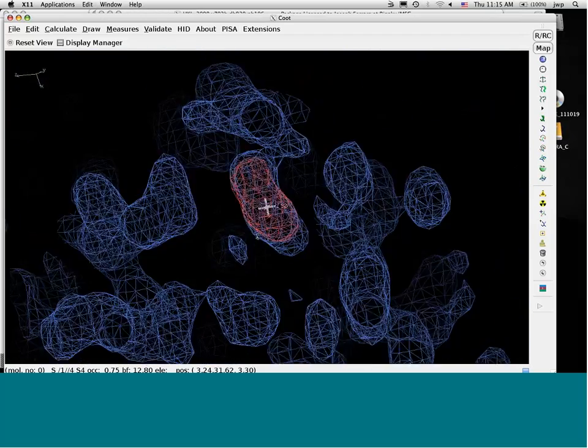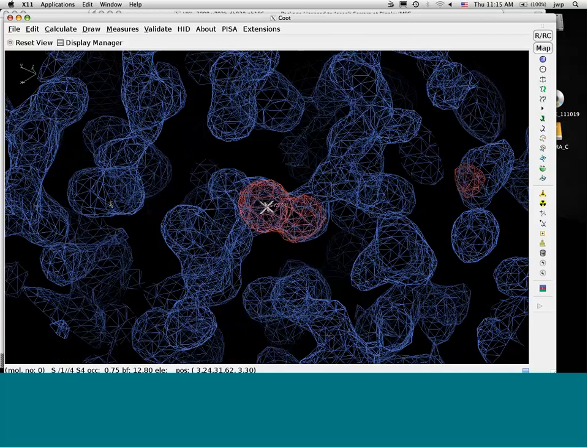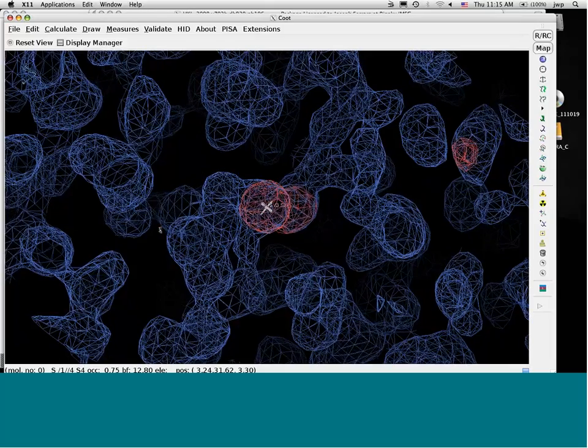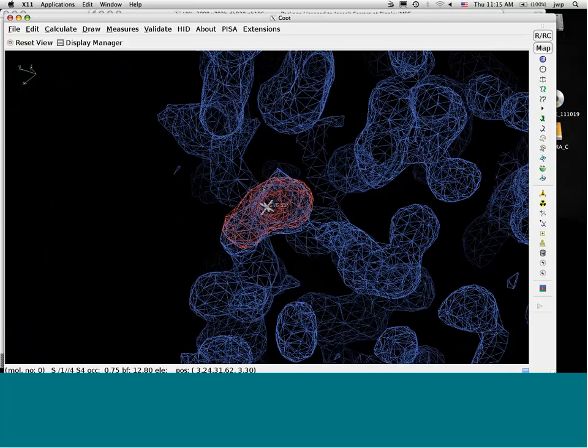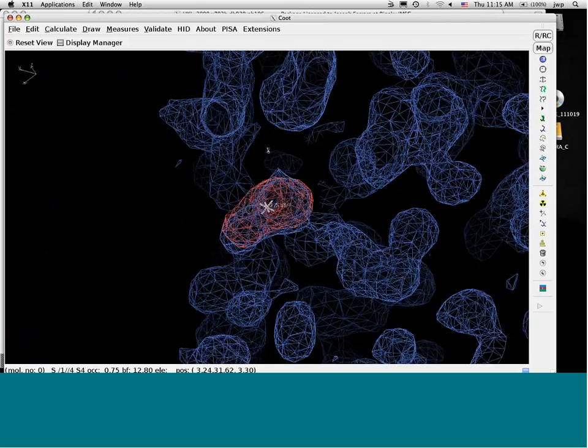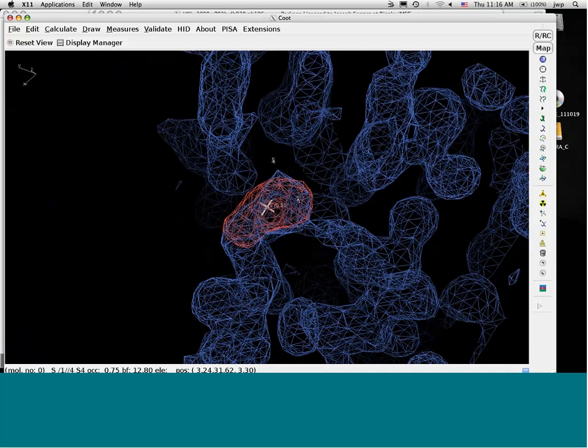It's a high resolution map, though. I'm not sure what's going on here. So basically I would not be afraid to go and always try to fit the map, even if the map looks crummy. I mean, auto trace it with these new powerful methods. They do a great job. As for maybe radiation damage as things shift around, cut your data back and see if it helps you.